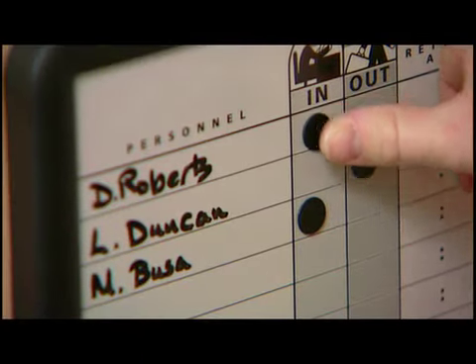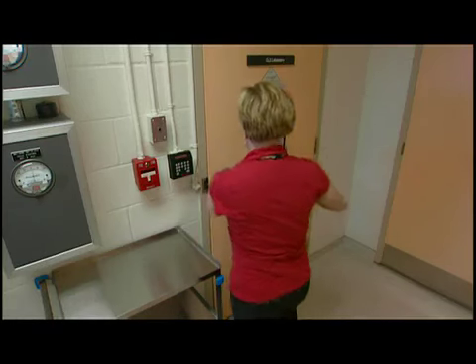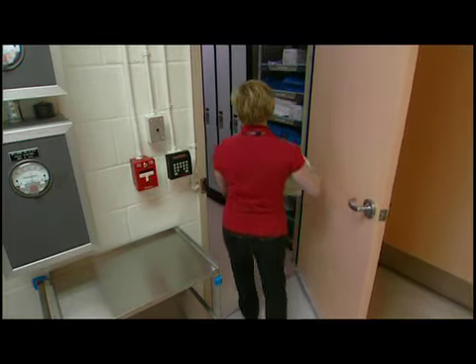Before entering the lab, it is important to sign in. A logbook or some means of documentation must be maintained to monitor the entry and exit of personnel from the Containment Level 3 laboratory. To get into the lab itself, you need to swipe your ID card and enter a personal identification number. A double key system, such as this one, can further restrict access.